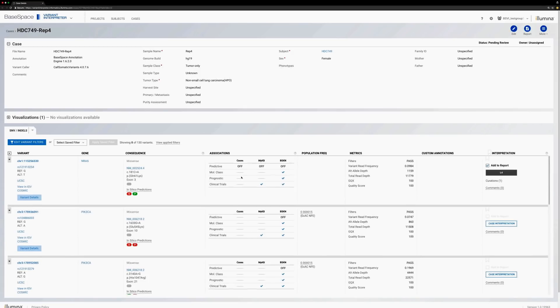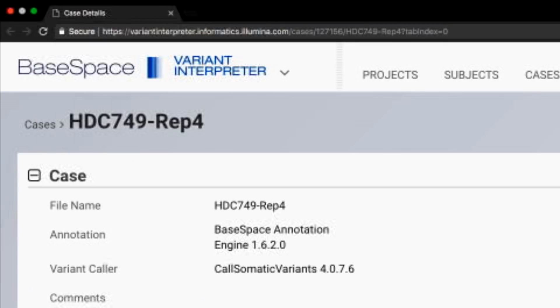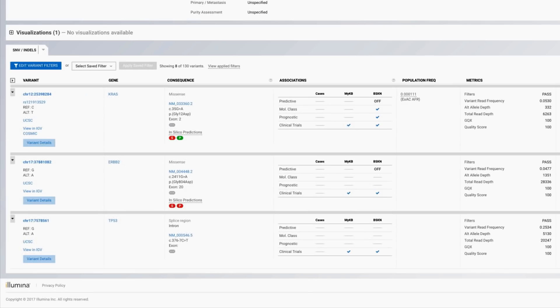For an even deeper biological view, these variant call file outputs, or VCF files, can be uploaded into Illumina BaseSpace Variant Interpreter software. By cross-referencing the variants in your sample against a large collection of annotation databases, users can rapidly identify relevant variants and perform annotations in an easy-to-read reporting format.